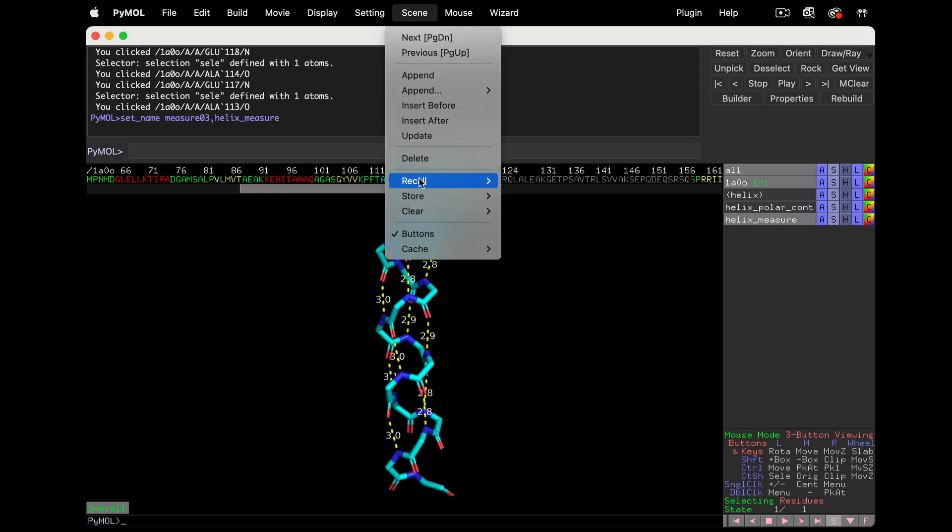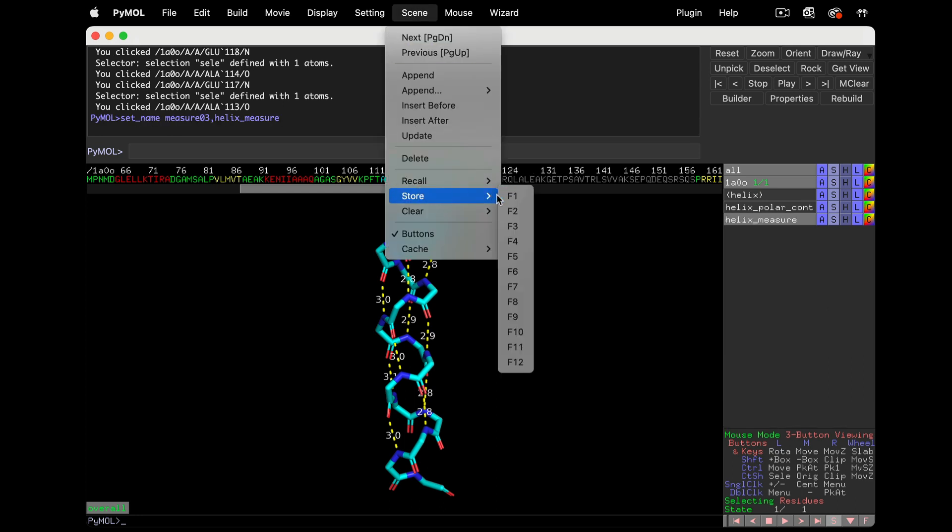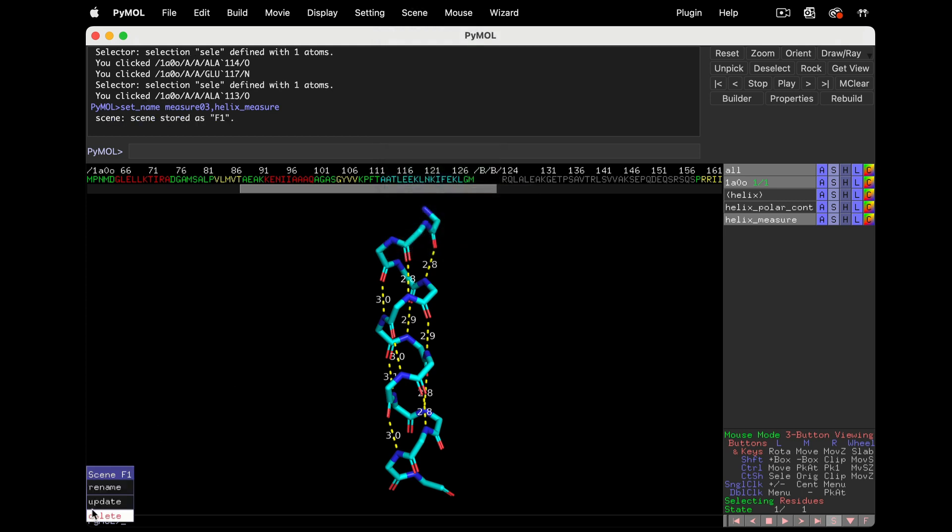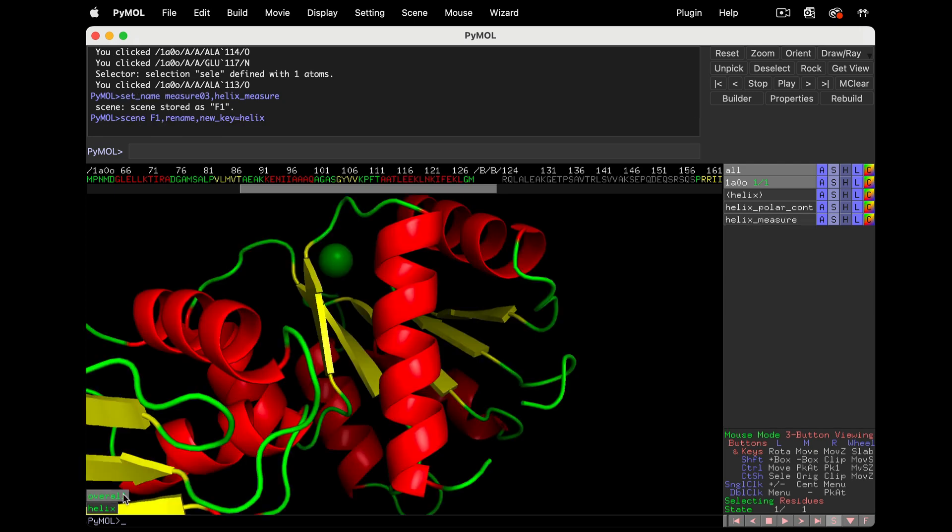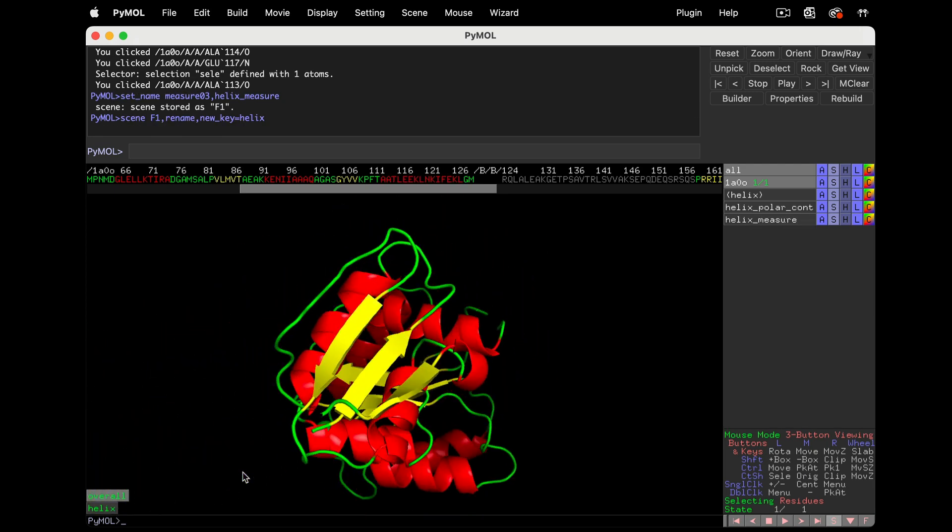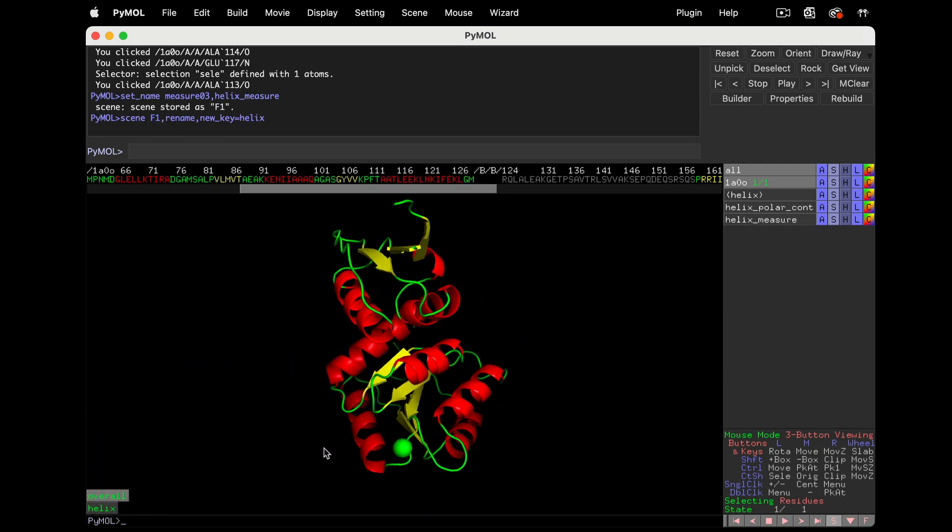And now we have one clean object that I'll rename to Helix Measure. A lot of work went into that rendering. Let's save a scene. I'll call my scene Helix. Now, let's use the scene we saved before to go back to the overall structure.